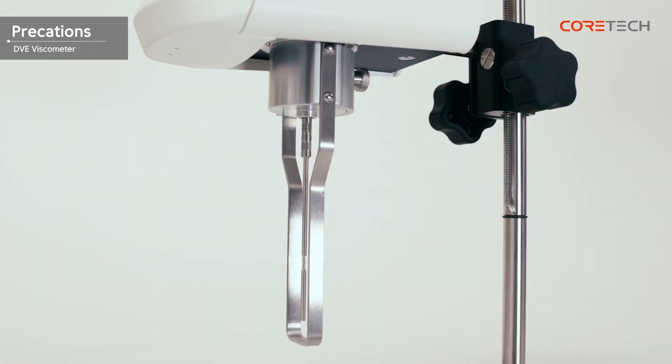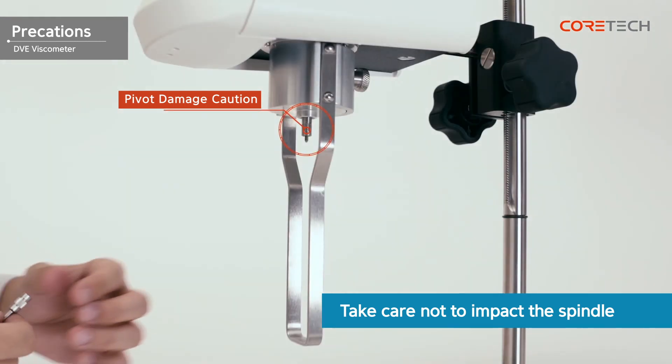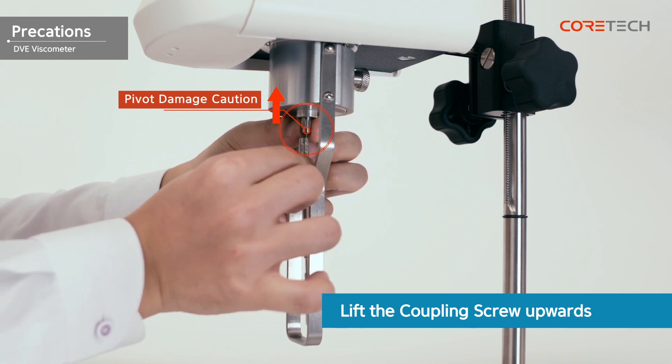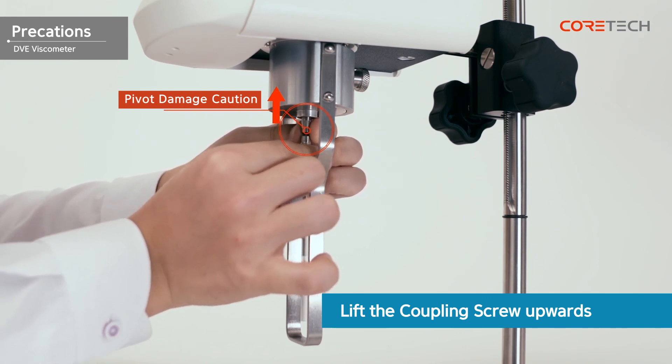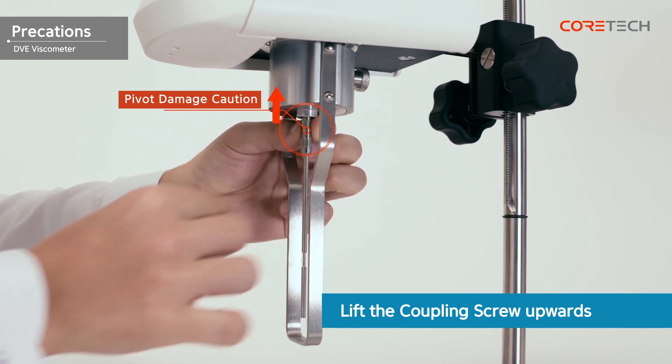Be careful not to shock the spindle while it is engaged, as the pivot is more likely to be damaged if impacted. When connecting or removing the spindle, always hold the coupling screw upwards to prevent damage to the pivot. If the pivot is damaged, contact the place you purchased it or CoreTech Korea for A/S service. However, in this case, even if there is a free repair period remaining, it will not be repaired for free.